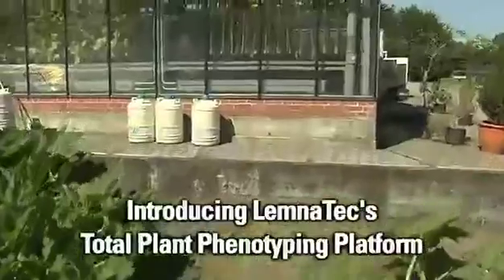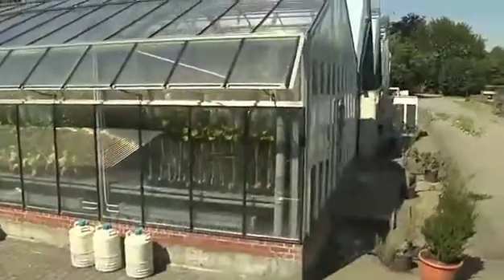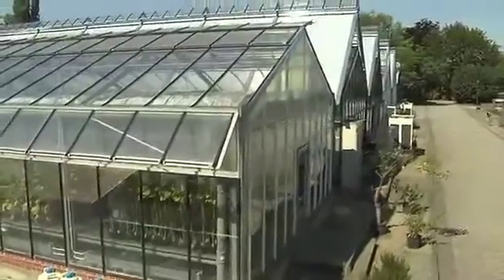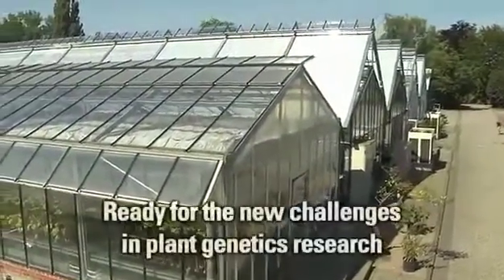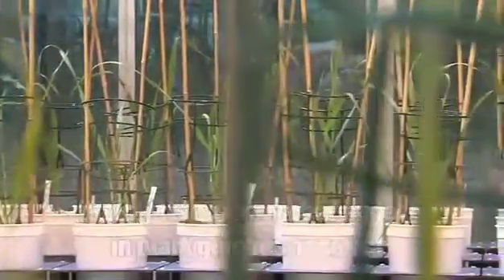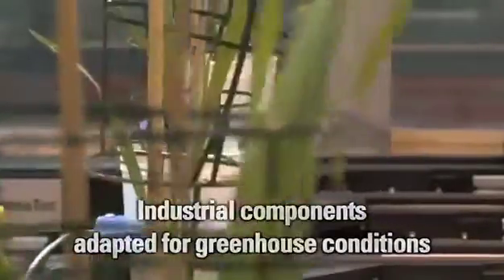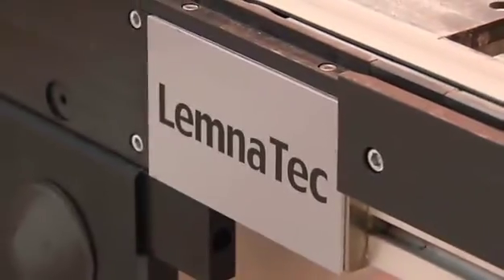Following the huge accomplishments in plant genetics, the subsequent challenge is the mapping of large populations for a better understanding of plant phenomics and integrated plant performance. Introducing the new high-throughput and high-content plant phenotyping platform, Lemnatec provides the technology to answer this new challenge.